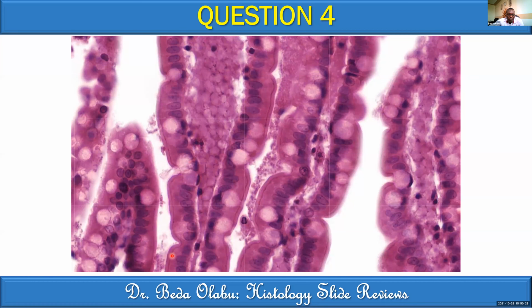So this is the epithelium, that one, and this one. Also this one, and that one. And finally that one. Let's focus on this one. How many cell layers do you see? One. Only one. So it is not pseudostratified, because we can see only one nuclear layer. So it's a simple epithelium. Is it simple columnar, simple squamous, or simple cuboidal, Christine? Simple columnar. Very good. So this is simple columnar epithelium.